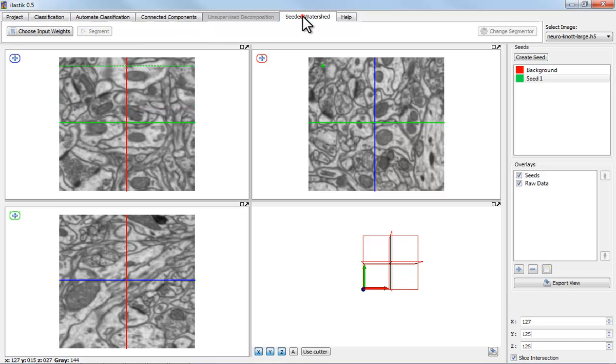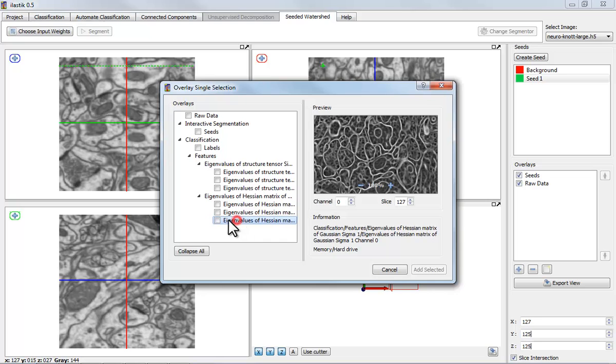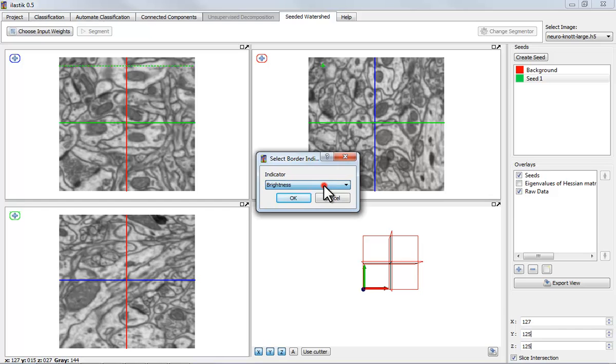Now I'm switching to the Seeded Watershed tab. As input weights, I'm choosing a set of features that I've just shown, which bring the boundaries out really nicely. And I need to say that in this set of features, boundaries are bright, not dark.